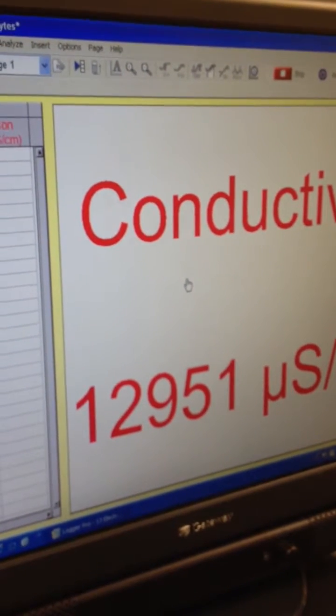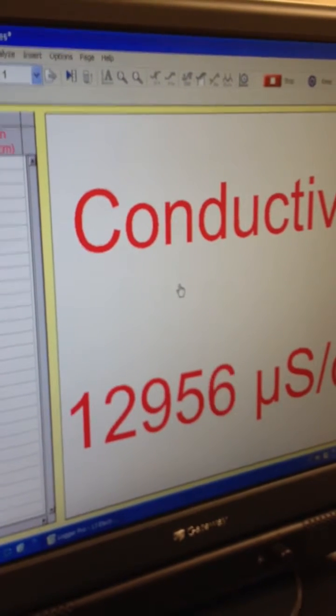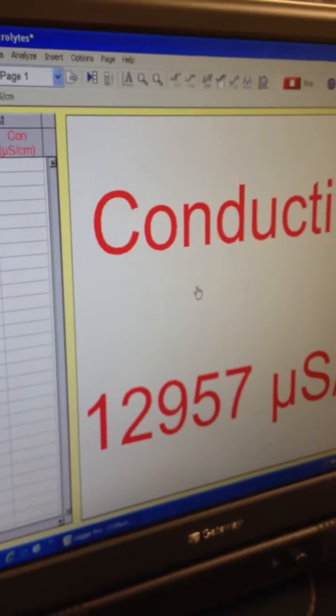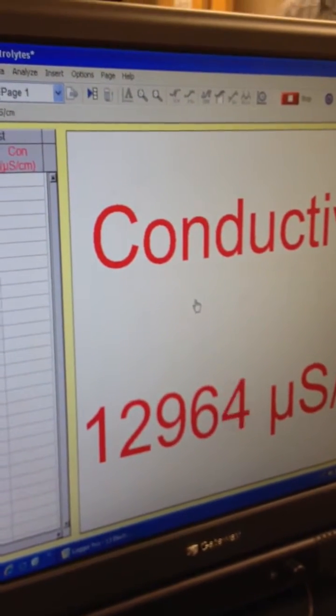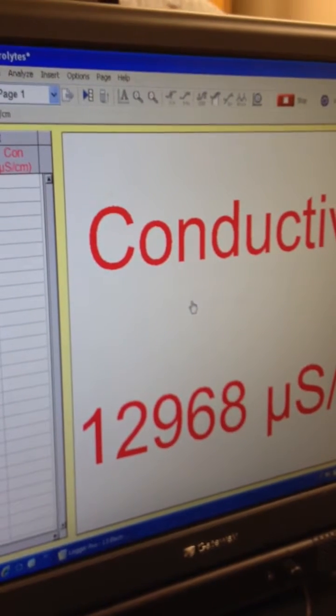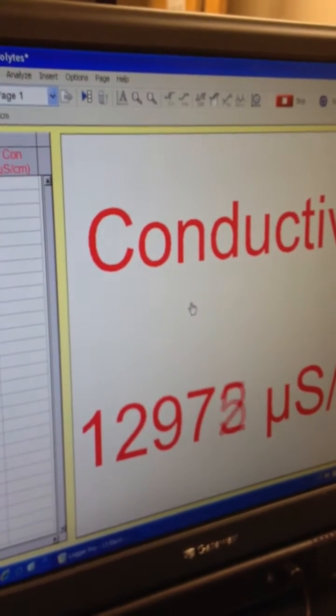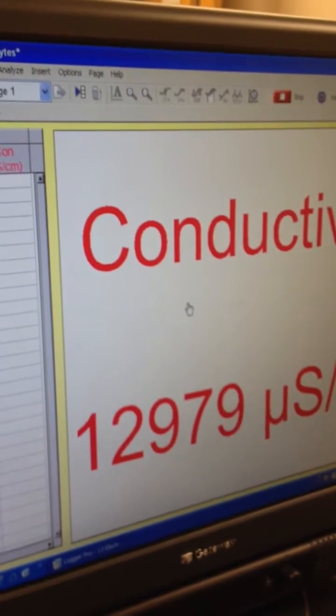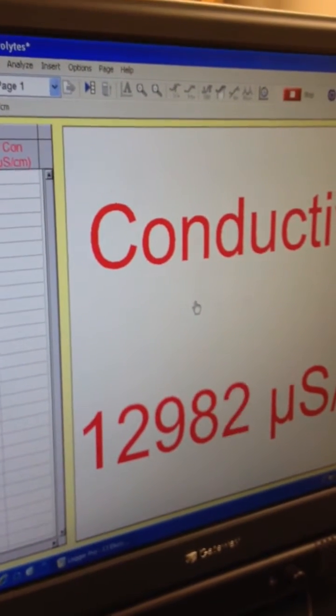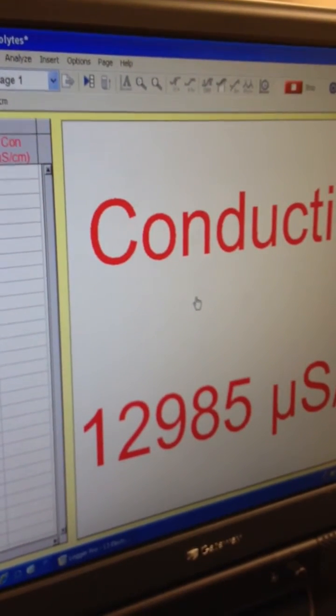So the chances of getting it completely stable are going to be small. But what you'll notice is that those first couple numbers don't change. If you see a little bit of variation in the last ones, that's fine, as long as you've got those first numbers nice and stable. And that's it. The actual techniques for this lab are pretty easy.